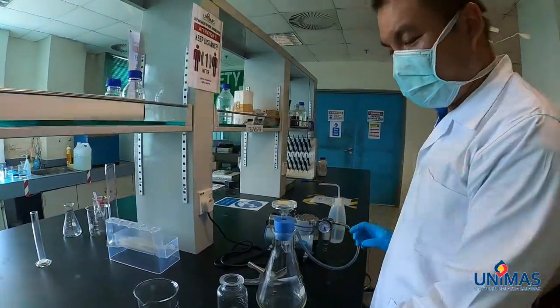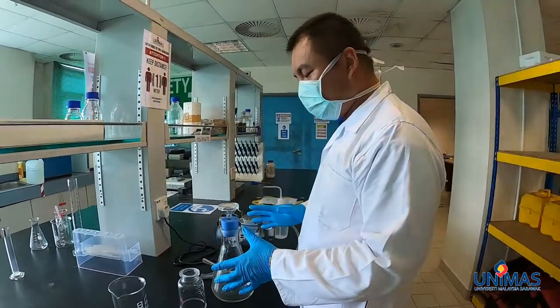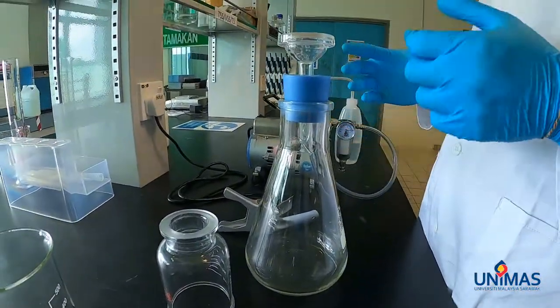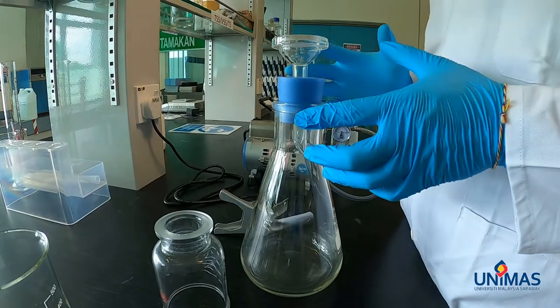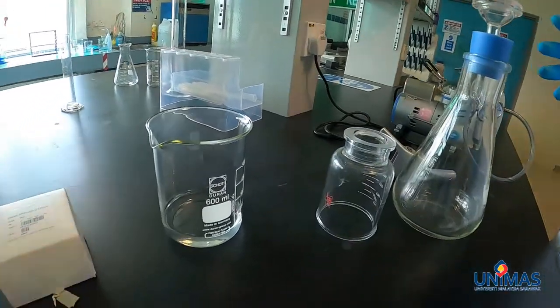This is the set that we are going to use. We are going to do the total suspended solid test, where we will filter the solids coming from the water sample that we have collected.